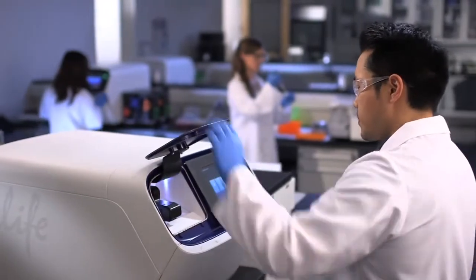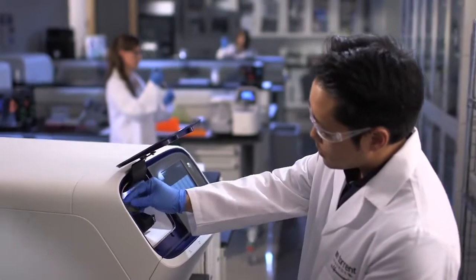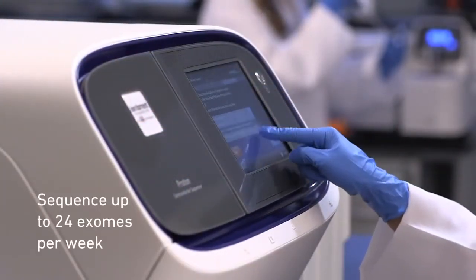And this is really going to change the game. There's no technology out there that's been enabling to do this kind of work. With Ion AmpliSeq Exome technology and Ion Proton, we really have a fast, affordable exome sequencing platform that you can do on demand and do up to 24 exomes per week.